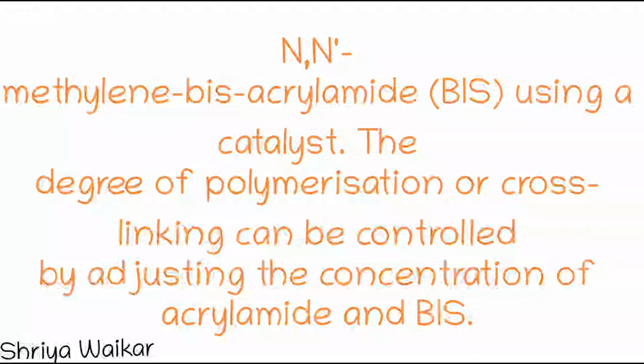A harder gel impedes macromolecules as they travel through the PAGE, thus affecting the resolution of the separation. So a soft gel, that is 4 to 8% acrylamide, allows high molecular weight molecules to migrate faster, while a harder gel, that is 12 to 20% acrylamide, restricts the migration of large molecules and selectively allows small ones to move through the gel.